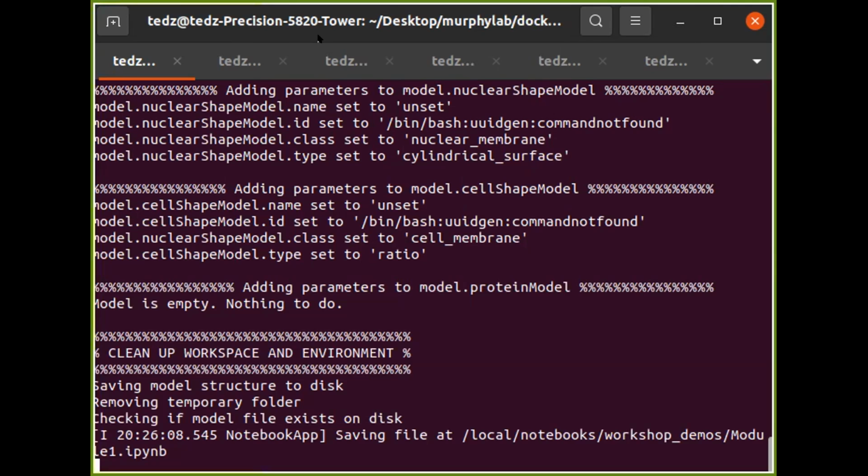Okay, yeah, got it. Copy that into the browser, and then you will get the CellOrganizer Docker window or notebook window. And what you should see is a local folder. Here, let me just share. Ted, you want to stop sharing for a minute and let me, so everybody can see what this looks like.